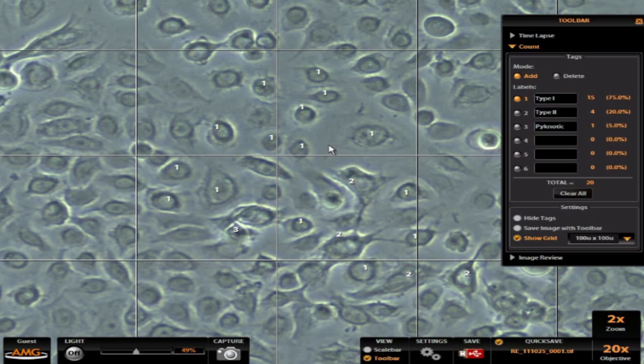So this is a fairly simple, straightforward tool that works very nicely. It has options such as saving the image with the toolbar. If we turn this on and we save this image, we're going to get not only the grid and the tags that we've put down here, but it's also going to embed this information inside of this count rectangle.